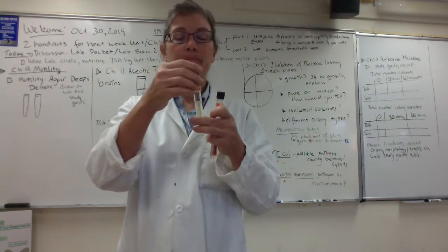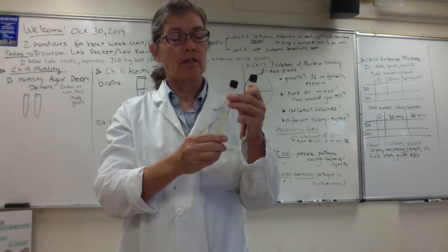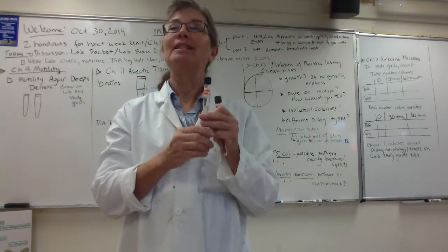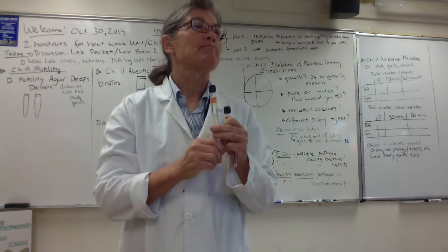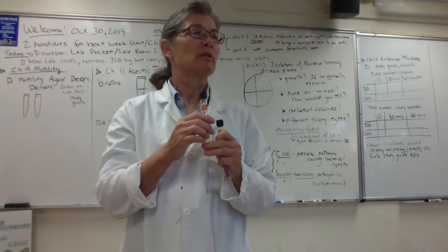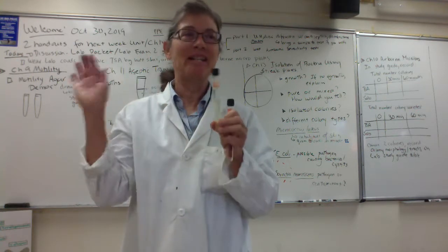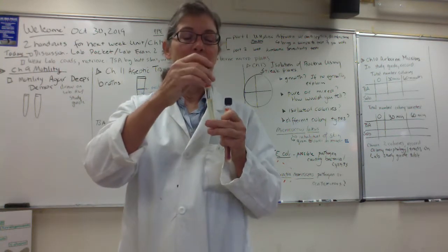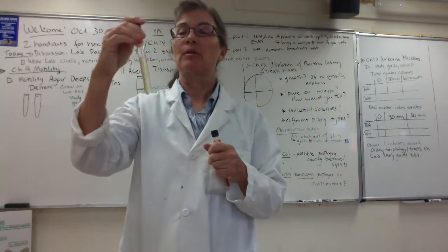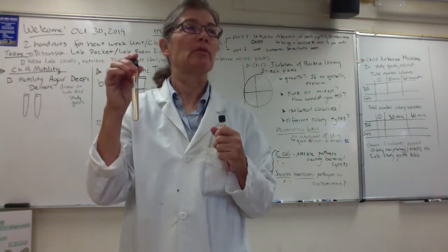So, in researching the formula for the Motility Agar deep, I discovered that it's not good for growing fastidious microbes. So what are fastidious microbes? Microbes that require a lot of preformed organic molecules, a lot of growth factors. And unfortunately, I didn't know this, our atrichous non-motile microbe is Streptococcus lactis, and the genus Streptococcus often requires a lot of growth factors.